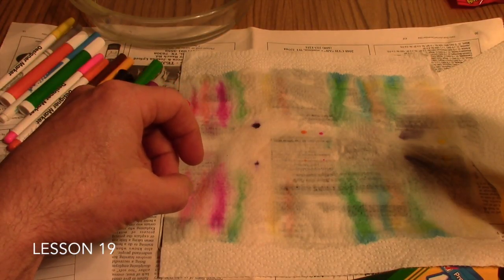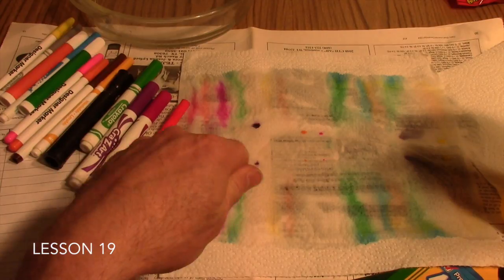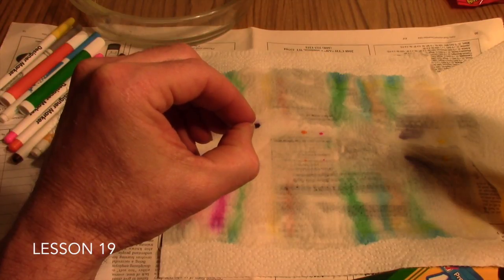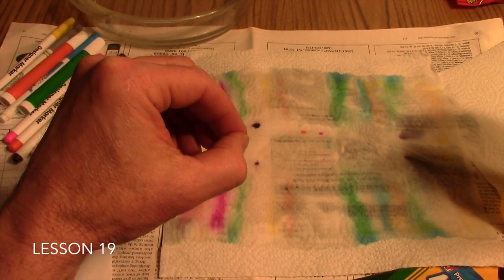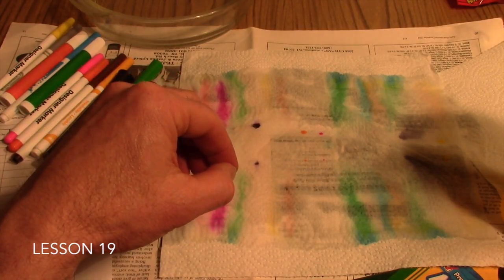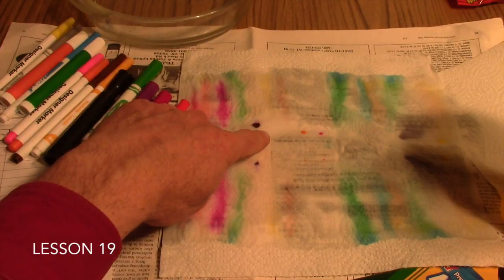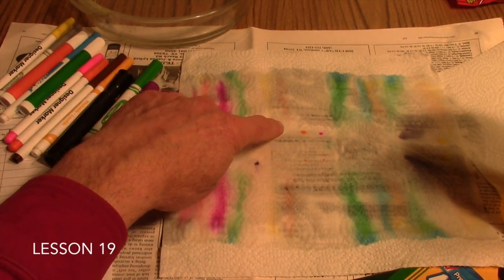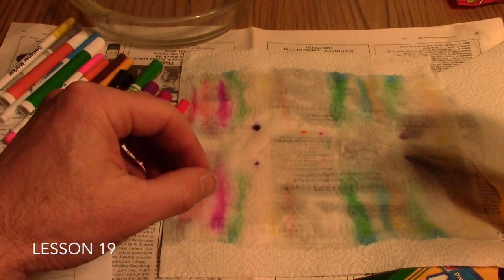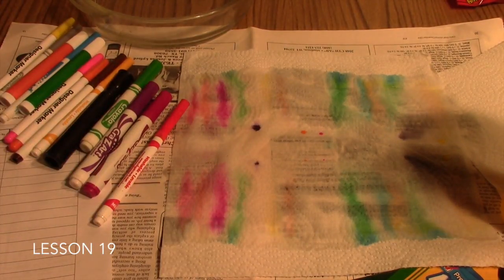And then you bring those back and you put them in a bowl and you just mash them. You just take the back of a spoon and just smash them till you get a little wadded bit of plant material there. You can add drops of water to it if you like, and you just smash it. And then you take either a toothpick or a small dropper, and instead of making the ink spots here like we did, you would just put concentrated spots of those plant pigments, and then go through the same process again. And it's very interesting to watch those pigments as they separate with the various solvents here in this lab.